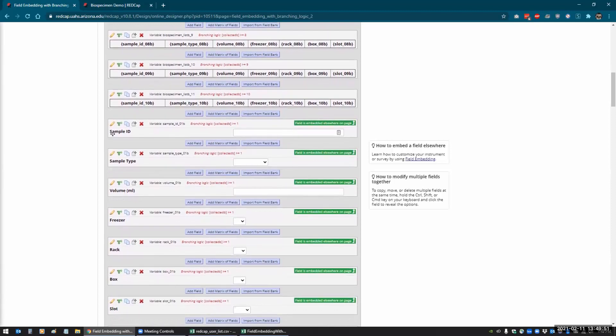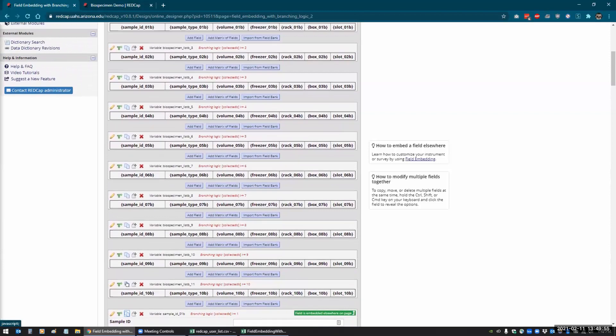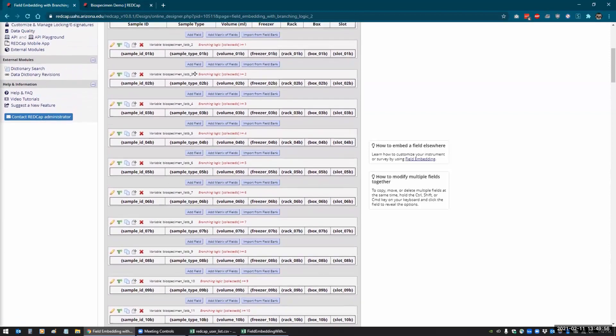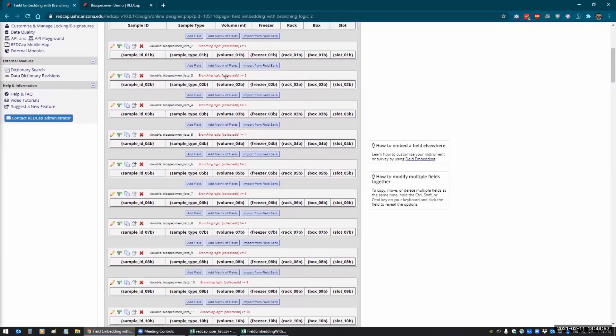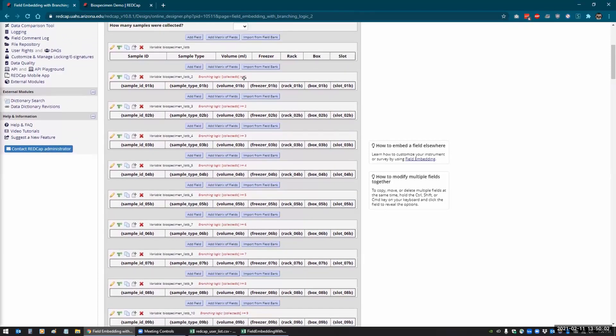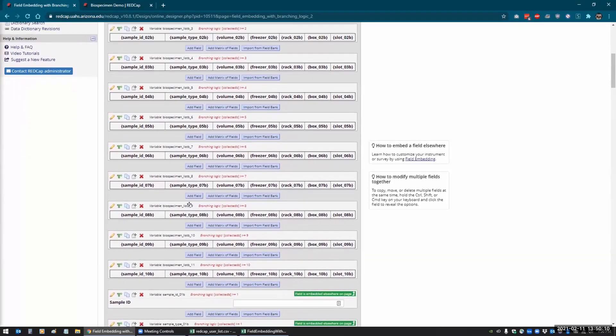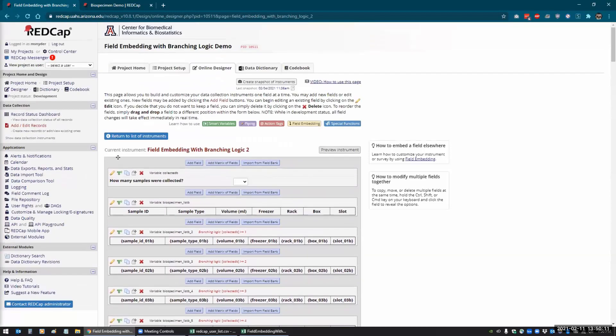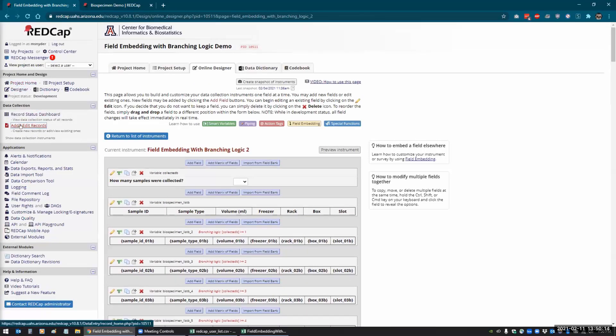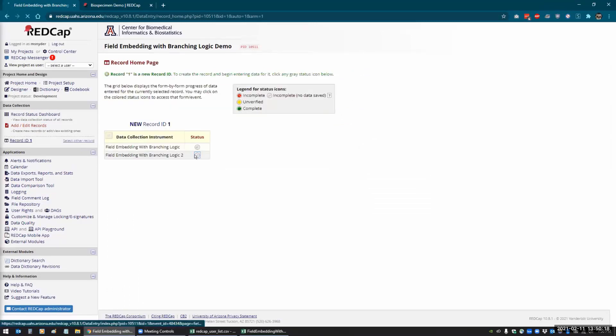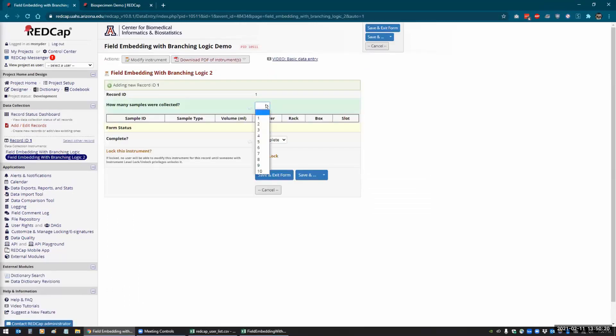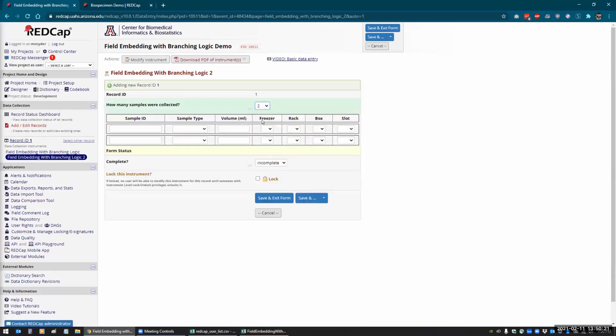But I still have the 10 copies of each one of these fields, but now what I do is I set additional branching logic here. So that way this first row is only going to be shown if there's one or more samples, this is only going to be shown if there's two or more, three or more, four or more, all the way to 10 or more. And that's what gives you the design where it only shows up if you select a sample. So if I select two, now it's going to show up there and there.